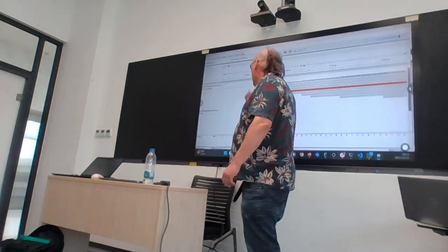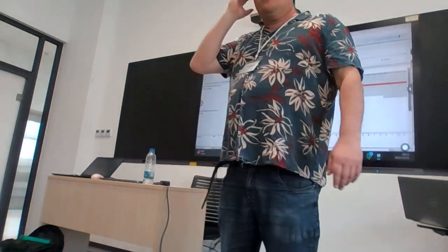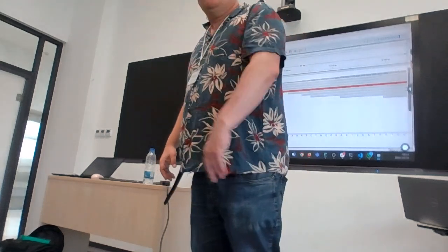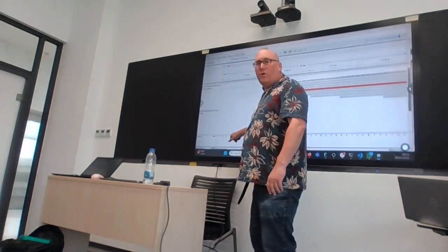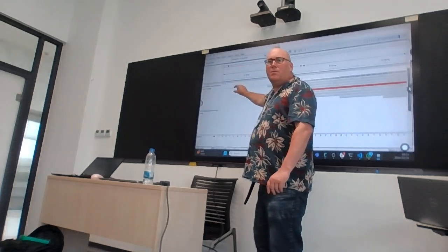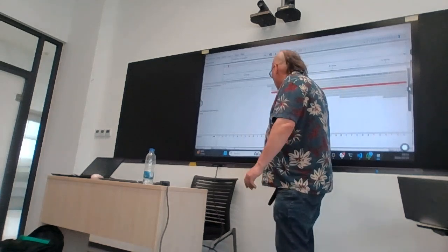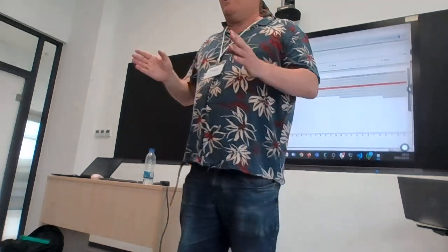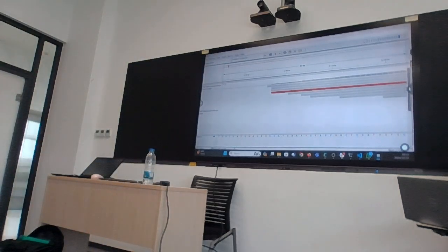This is what the reference is showing. The reads are basically showing very little information. What letter should we put in the consensus genome? N. Where we have no data, we mustn't put a C because we don't know if it was a C or a T. Where there's no data, or low depth, with only a few reads, we must make all of these positions in our consensus genome into N. If we don't have the data, we must say N.